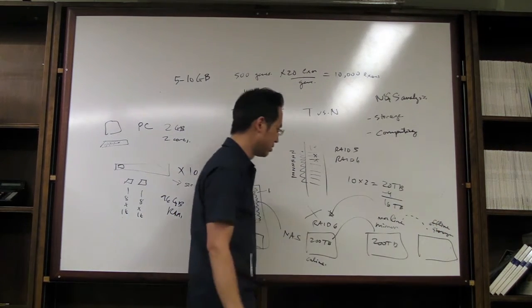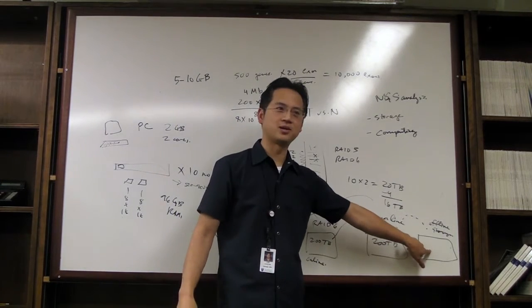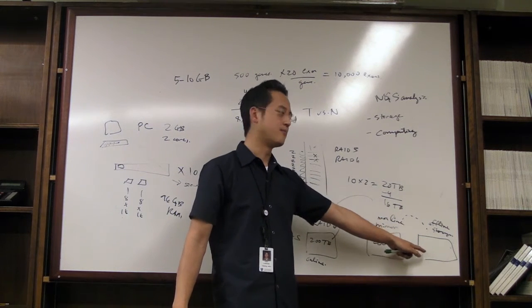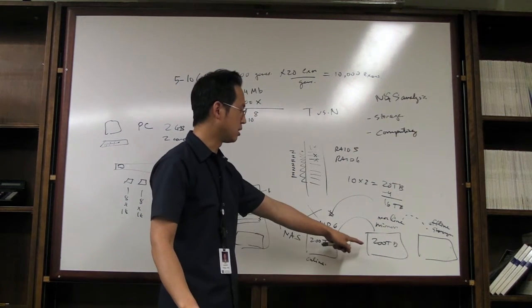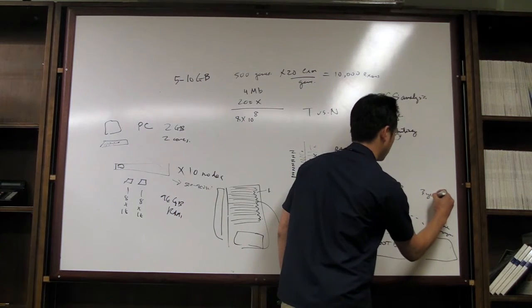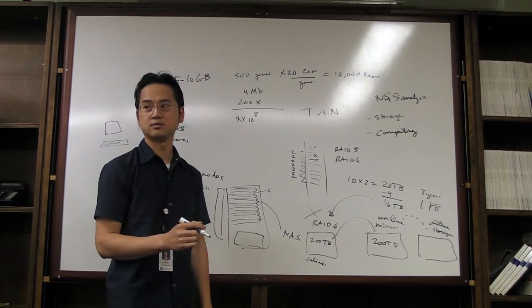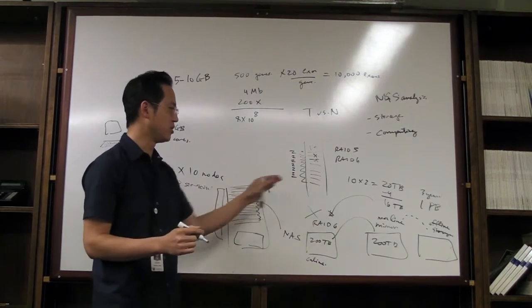So possibilities are you convert this into tape, you put it into a box and you send it to a place like Iron Mountain or Recall, and they'll store this in their facility. It'll be crazy to have to recover this data. But you need some cheap solution here, because over 10, maybe 5 years or so, or maybe even 3 years of operation, we're looking at about 1 petabyte of data. That's a lot of information. So this is all the sort of nuances of the computing system.